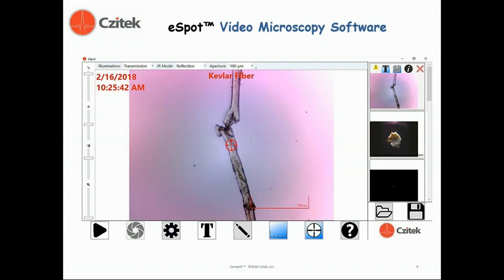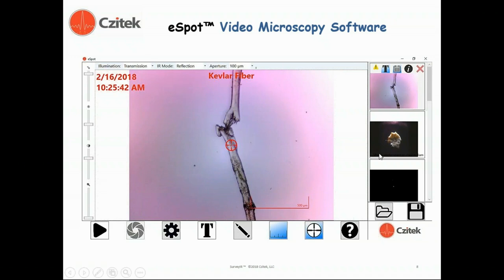With the Surveyor, we employ integrated video microscopy software called eSpot. This allows us to control features of the system, including the targeting aperture dimension — shown here as a 100-micron aperture on a Kevlar fiber viewed in transmitted light illumination. We can also control our infrared modes of measurement, analyze and document images, and save them to disk as either a TIF or JPEG file.